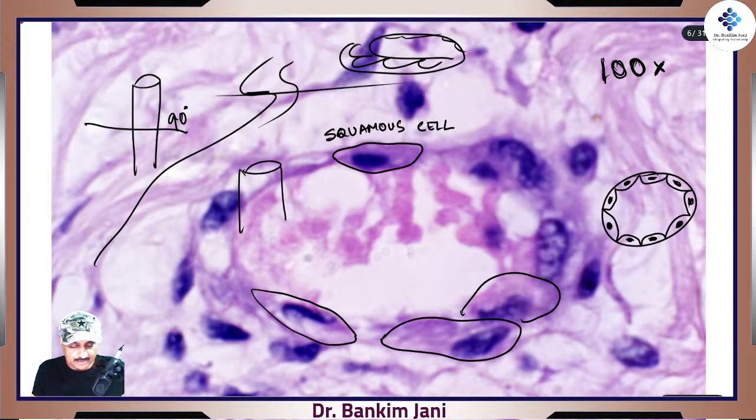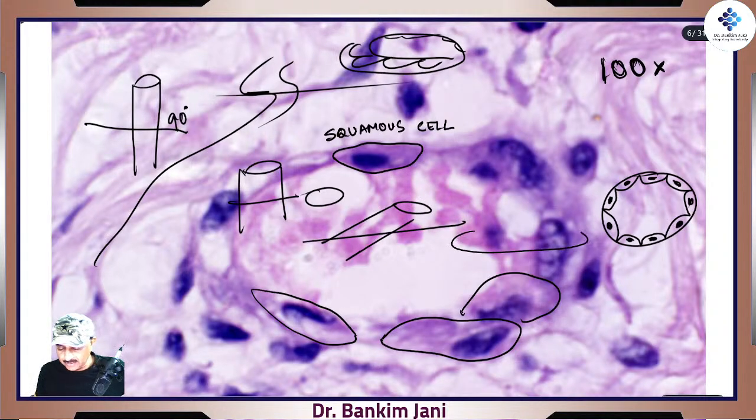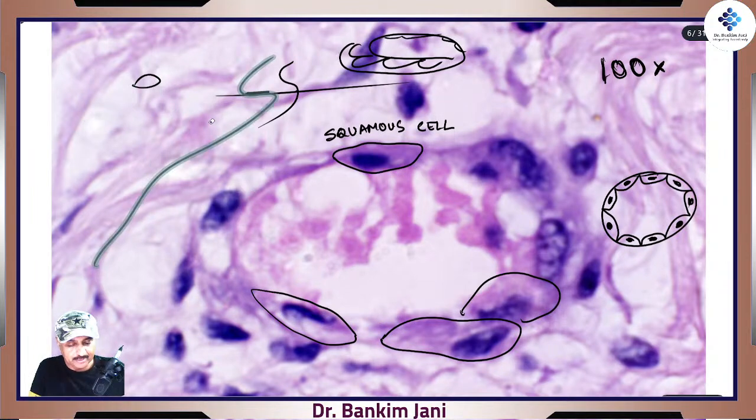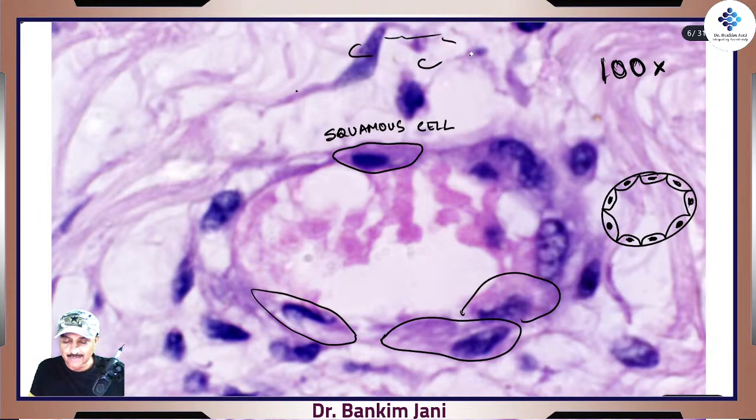When we take a section over here, its section is round. But when the tube is like this and then the section is taken, this particular section would be like this, elongated. So that's why cells will be at multiple layers. This is reality. When we see it in books and when we see it in reality, things are quite different, exactly like humans.